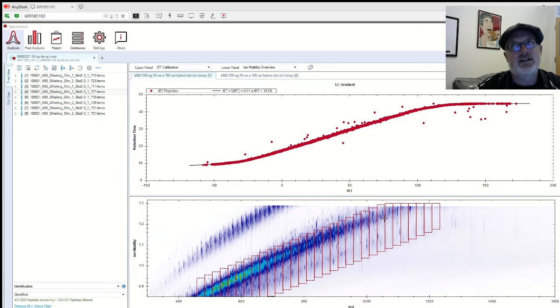These are not the ion mobility windows, but the data independent acquisition windows. Go look at our data independent acquisition talk, which I really have to redo. This will tell you what the DIA windows are. You can see there are dots outside the windows, and if anything is outside the windows, we won't see it. This is not normally important for these experiments because they're bottom-up digested experiments. But if you're looking for cross-linking or something big, you may want to double check, because anything outside of these windows, like these right here, we will not see.